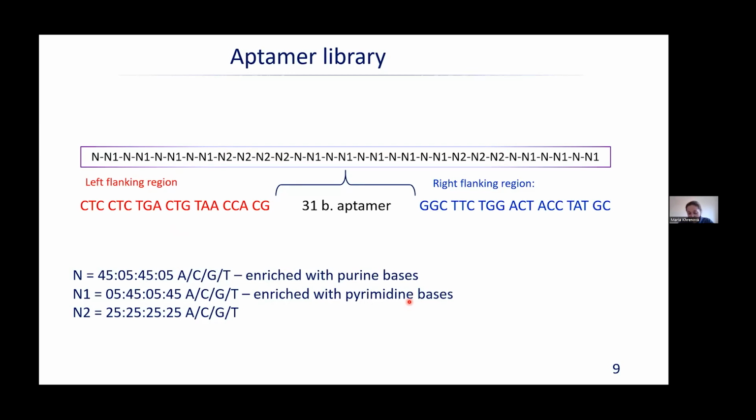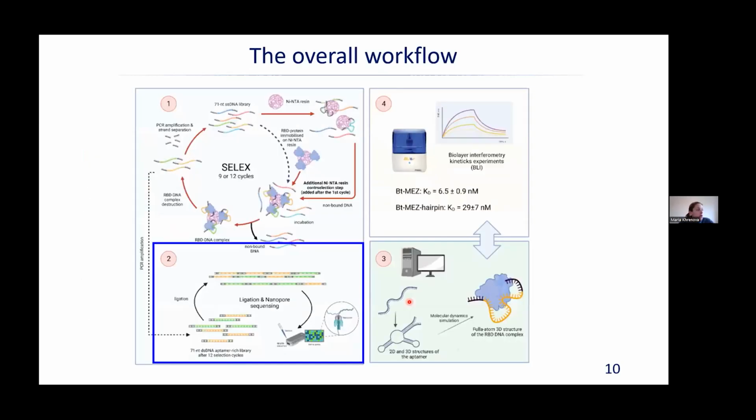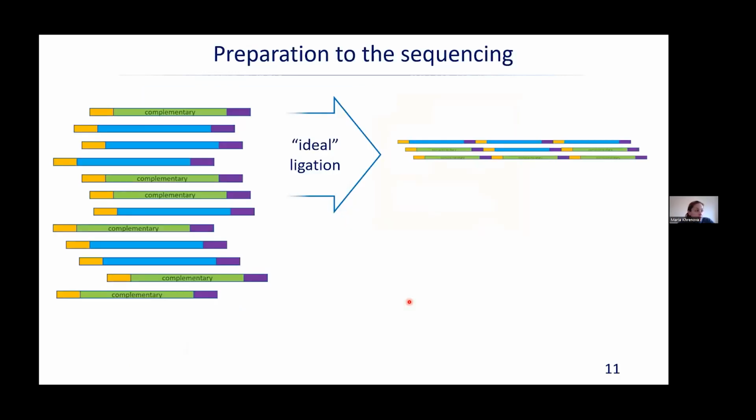Actually, as usual, what we want to do and what we obtain are two very different things. So, what about ligation? What about the process of obtaining long reads from these small oligonucleotides?